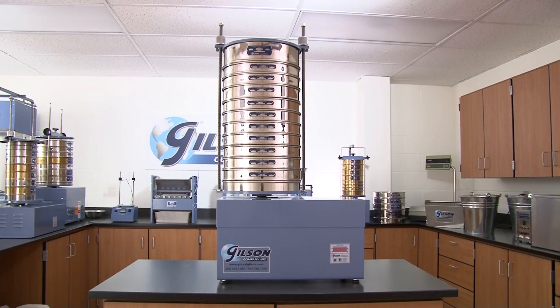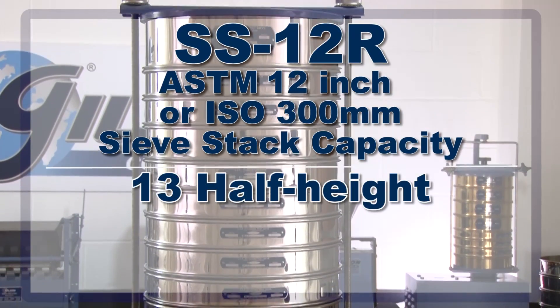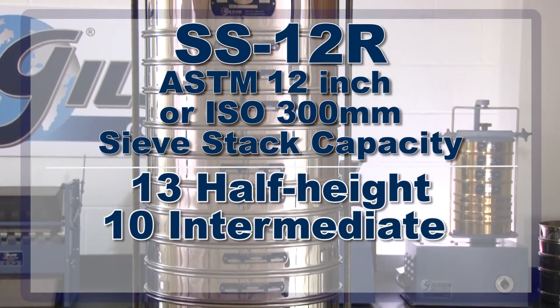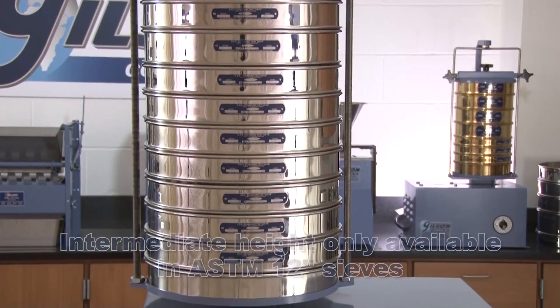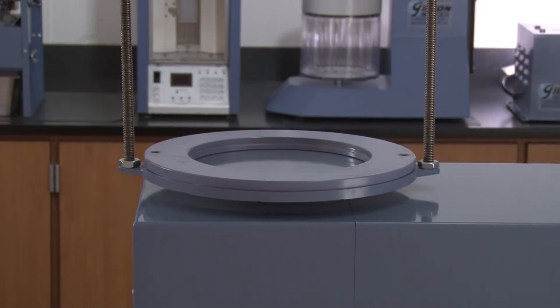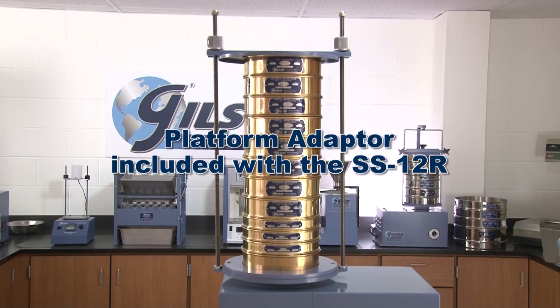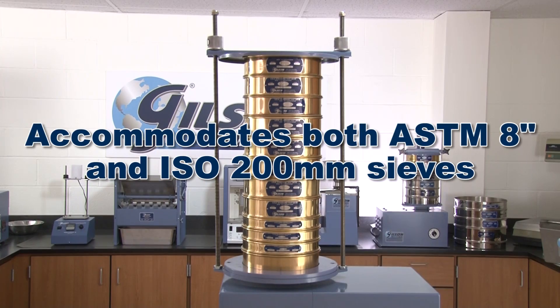The Gilson SS12R tapping sieve shaker can hold up to 13 half-height, 10 intermediate-height, or 6 full-height ASTM 12-inch sieves or ISO 300mm sieves plus a pan. And when used with the Gilson platform adapter, the SS12R can accommodate ASTM 8-inch sieves.